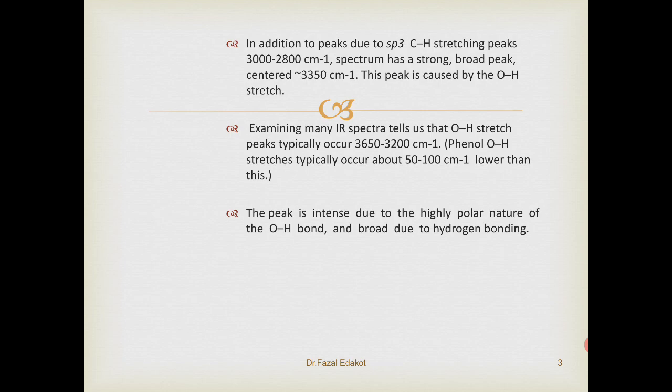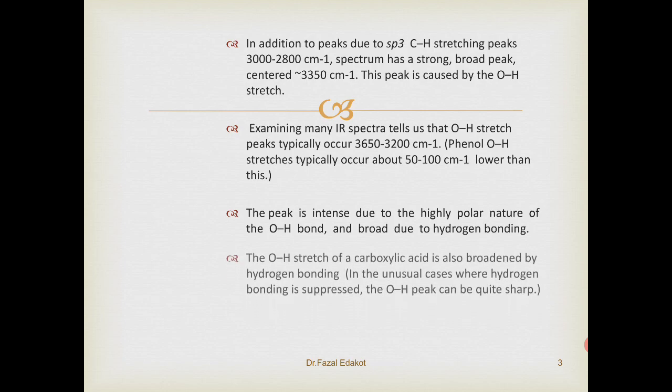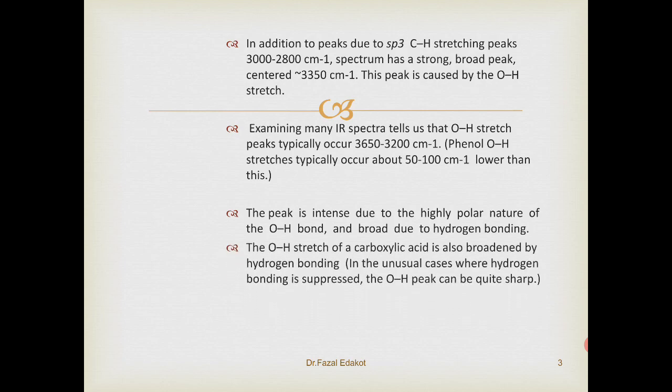Why are the IR peaks broadened? It is due to hydrogen bonding. The OH stretch of the carboxylic acid is also broadened by hydrogen bonding. In the unusual cases where hydrogen bonding is absent, the OH peak can be quite sharp.